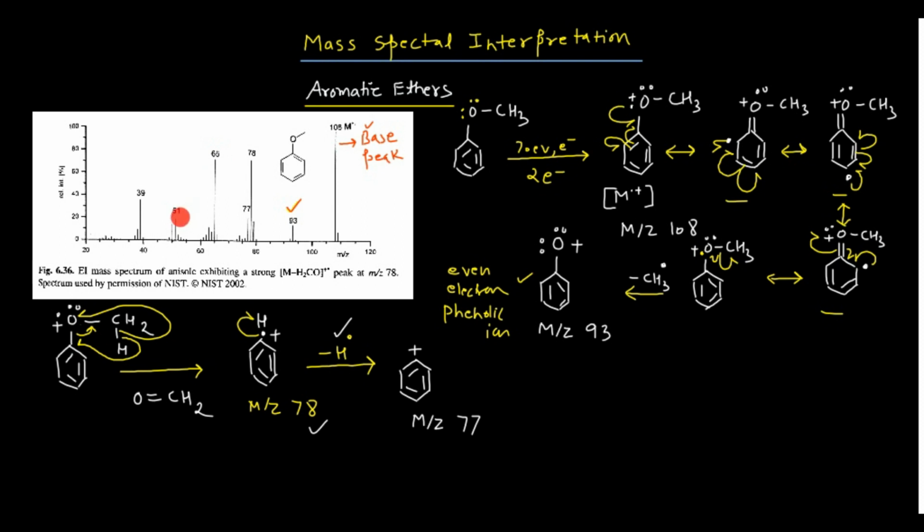For this, you need to look very carefully at what I'm doing. I'll give numbers to this benzene system: 1, 2, 3, 4, 5 and 6. Six carbons are there. Now what can happen in that case? I'll break this particular bond, and this bond, and then this bond. Basically, I am removing an acetylene molecule from here. This fragment loss is pretty facile in the aromatic system, and you can find this cleavage in various examples, not everywhere.